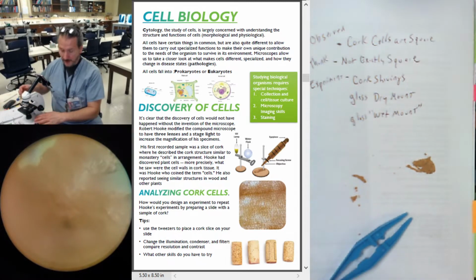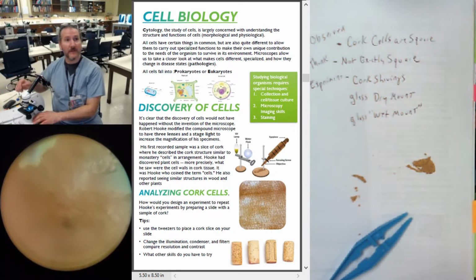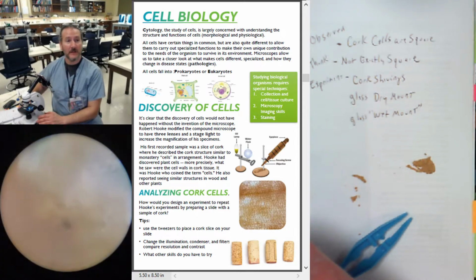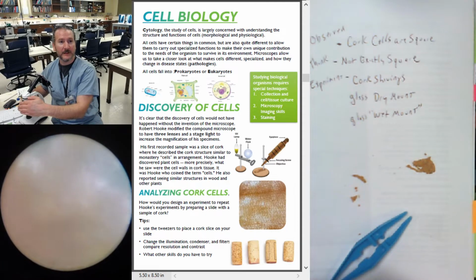So I'm going to flip my underlighting on. So I'm going to flip the power switch to the 2. Remember, you have the rheostat over on this side that controls how intense your light is. I'm going to put my hand up here just a little bit to try and block some light. Right, played with the brightness a little for contrast. Now I'm going up and down. That looks pretty decent.